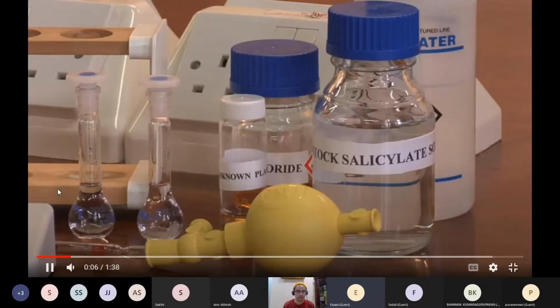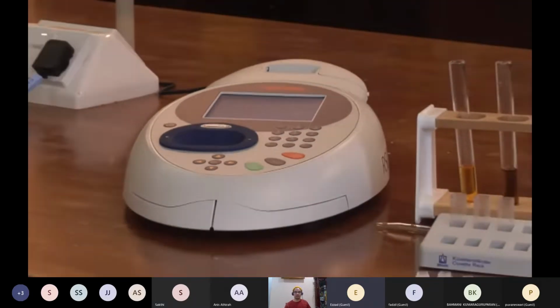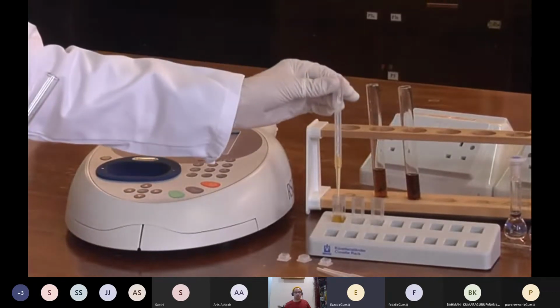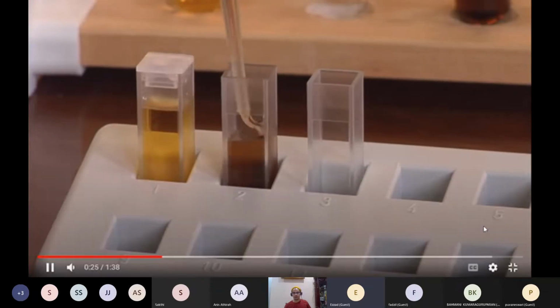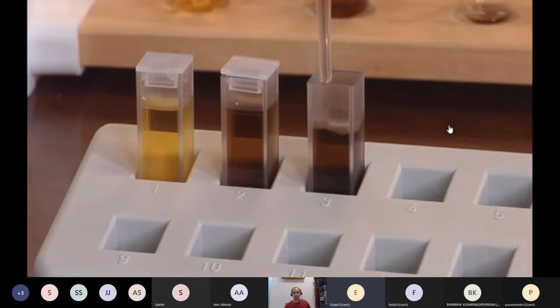Sample is dissolved in a suitable solvent. It is important to check that the sample is completely dissolved. The cuvette should be filled until about 3/4 full. It is important to ensure that the clear faces of the cuvette are clean. The cuvette is carefully stoppered.